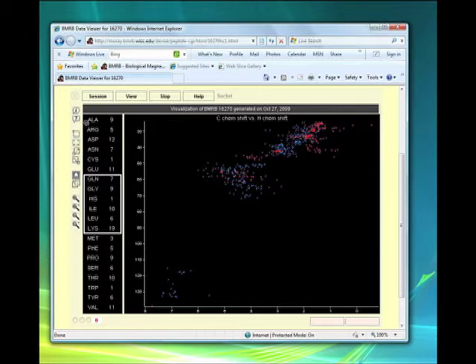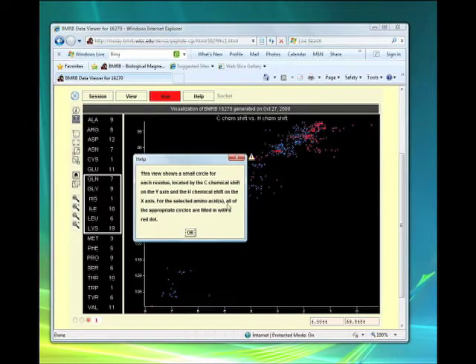Another useful mode is View Help mode. Many of the visualizations have help information for each view, which gives an explanation of the data the view shows and how it functions in the visualization. When you click on a view, a dialog is shown with the view help info.